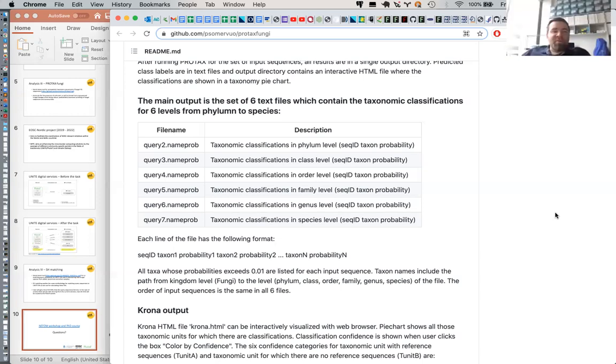Yes, but it can probably be simplified just by using first plus that certain matching threshold, and for those that are not matching, let's say more than 99%, for those you can do this plus. But well, these are anyway the details.